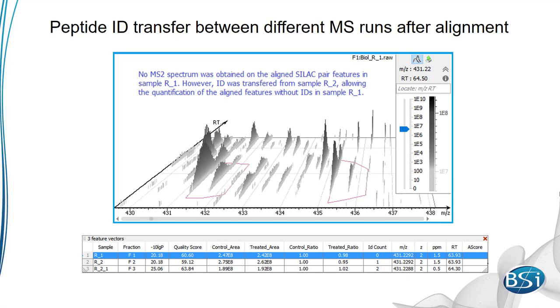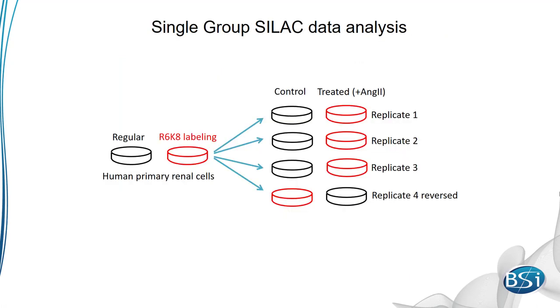You can tell which run the ID was transferred from using the All Vectors button in the peptide tab. The matching runs will have the same –10 log p score, m over z, charge, ppm mass error, and retention time. Now that we've seen how PEAKS accurately quantifies peptide feature pairs from SILAC experiments, let's put it into practice.